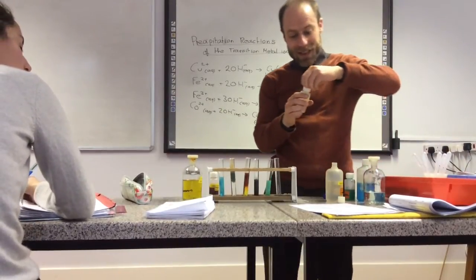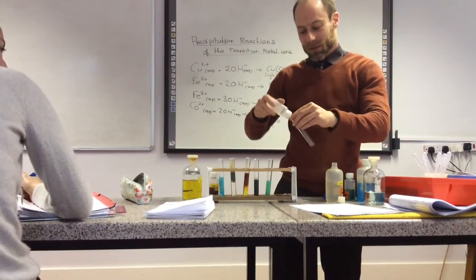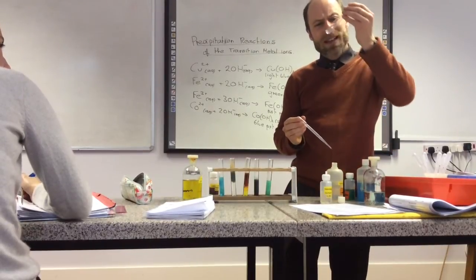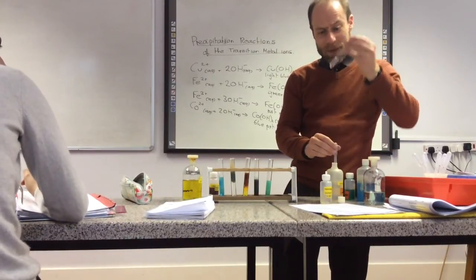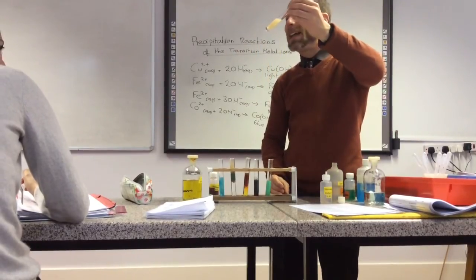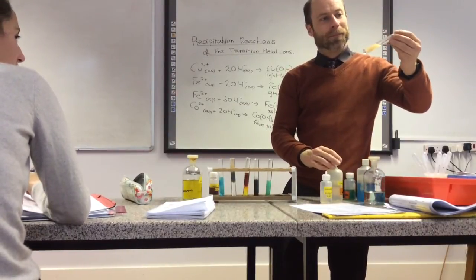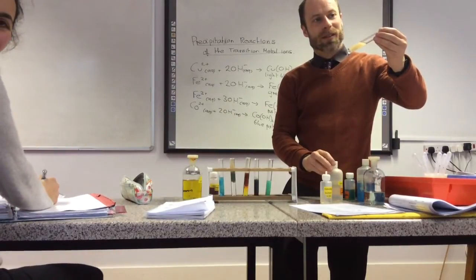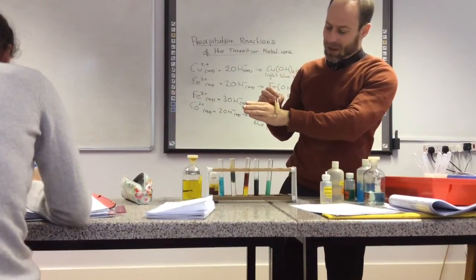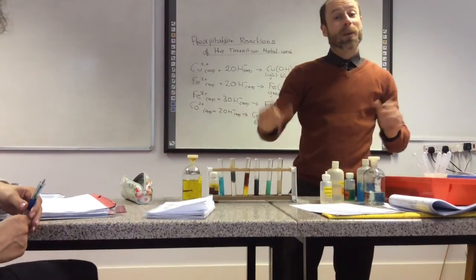One more — let's do manganese. It's slightly pink, maybe. Okay it's like a beige — between skin-coloured and cream. I think we will finish it there. Thanks very much.